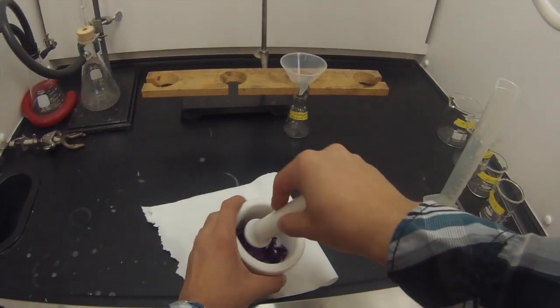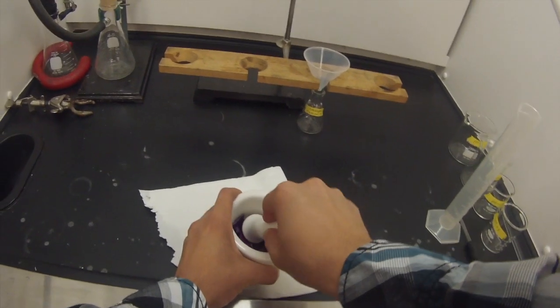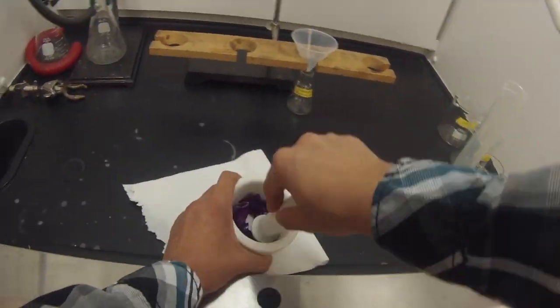So this is the Acids and Bases Lab. To start, you'll take six pieces of cabbage and grind them together in a mortar and pestle for five minutes.